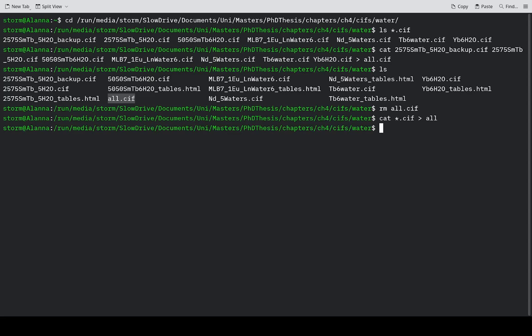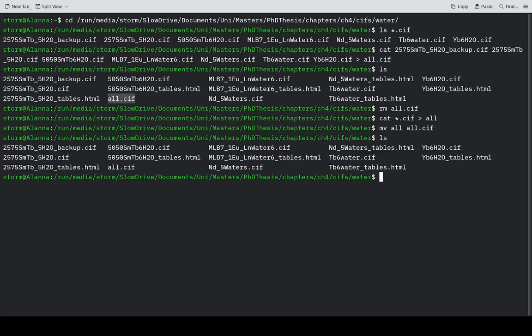Then just move all to all.cif. And we have an all.cif.